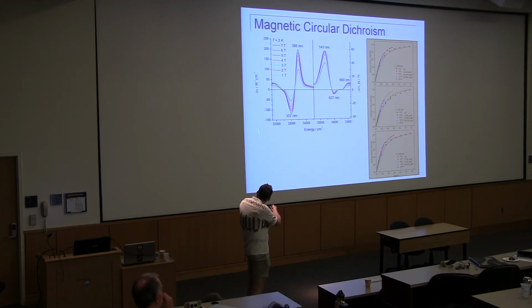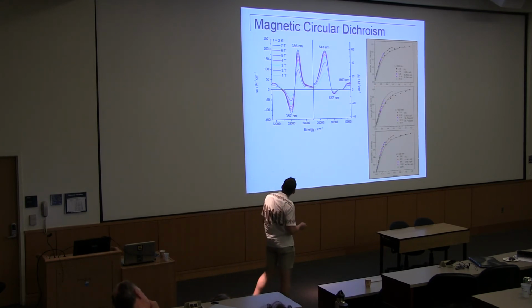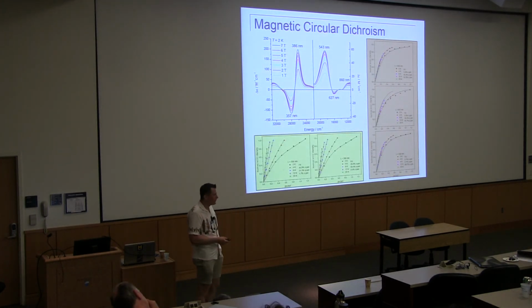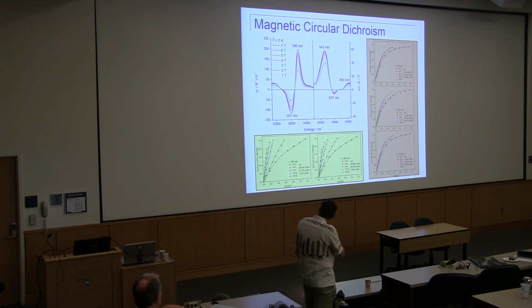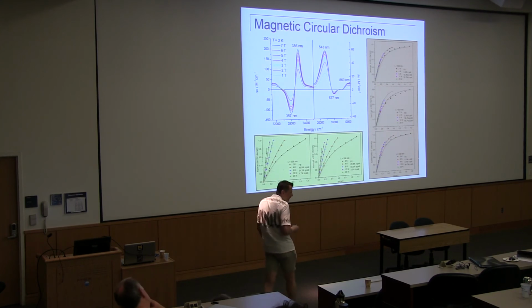But what about this one here? Remember, this is the very intense transition around 368 nanometers by absorption. You can see that those magnetic saturation curves look completely different. They show a really, really large degree of nesting, and it turns out they're XY polarized, in the XY plane.